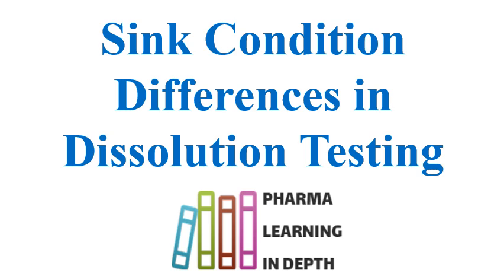Also, to maintain the same saturation, you should calculate the sink factor. I have made a separate video on sink factor. You can go to that video and get the idea about sink factor. So calculate the sink factor for the different strengths, and then calculate the volume of media or the level of surfactant needed for that particular strength.